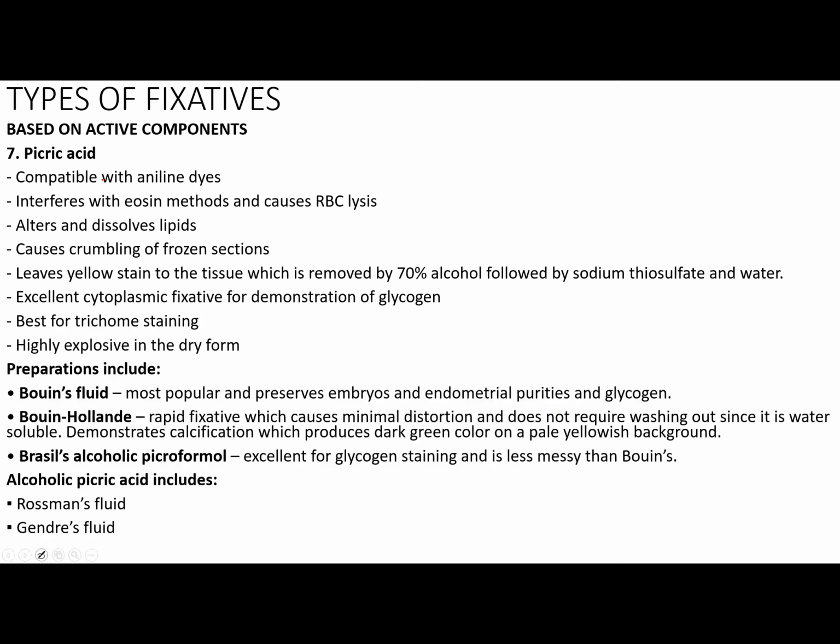Now, picric acid is compatible with aniline dyes, known to interfere with eosin method and causes RBC lysis. It alters and dissolves lipids. Causes crumbling of frozen section. So, you cannot use it for frozen section.